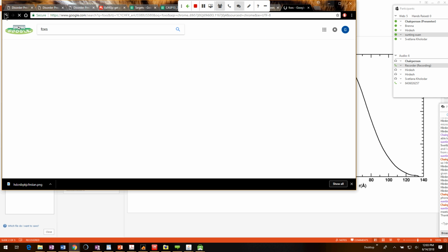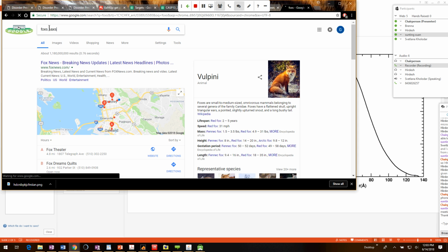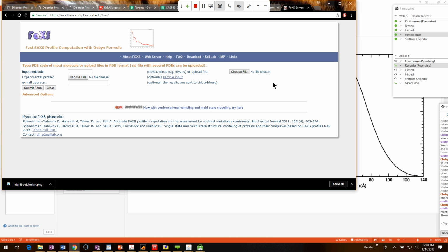Yeah, in ATSAS basically. I used OLIGOMER. They have OLIGOMER, and it's a very good program. So that's one way to do it. Another alternative is to do this FoXS thing, which is online. If you do a Google search for FoXS and SAXS, you have to put the SAXS in, otherwise you end up at Fox News.